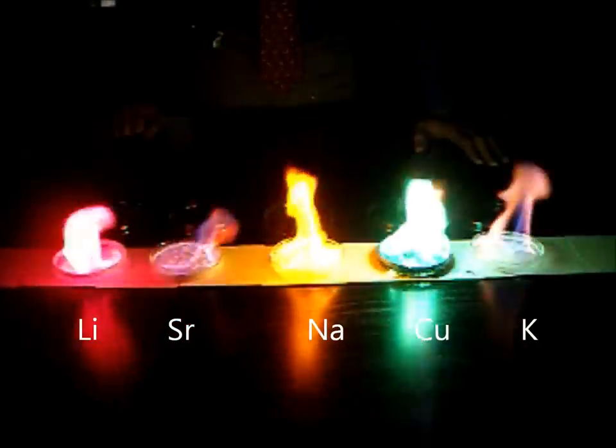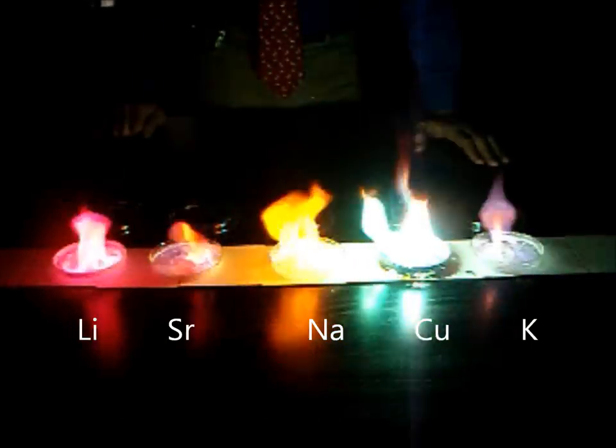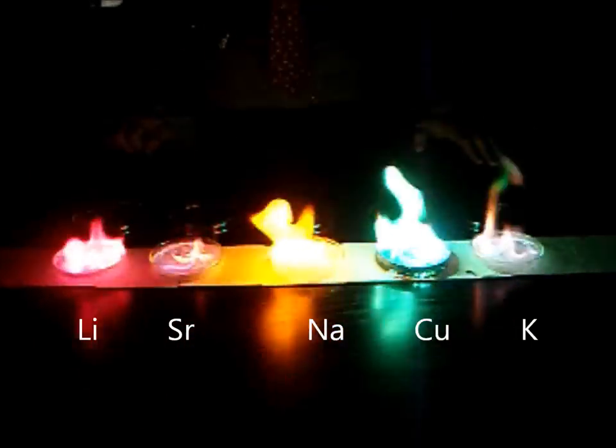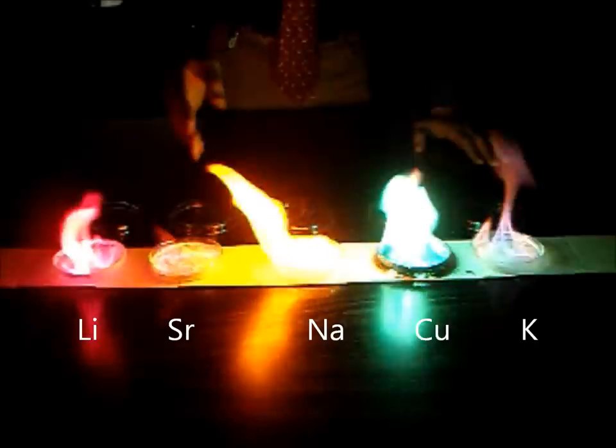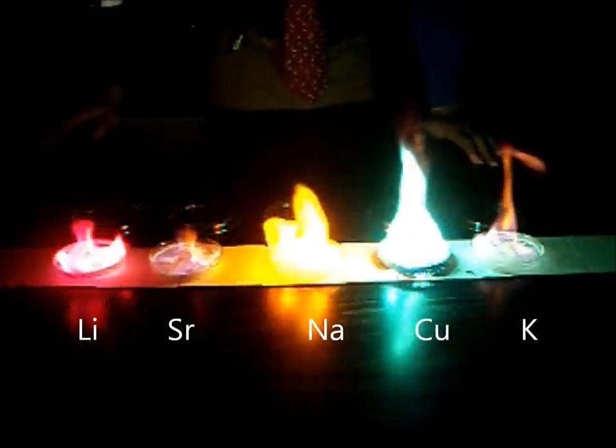So they give off the energy in discrete packets, very specially sized packets, that we call photons. These photons right now currently are in visible light spectrum. Pink for lithium, orange for strontium, yellow for sodium, green for copper, and again purple for potassium.